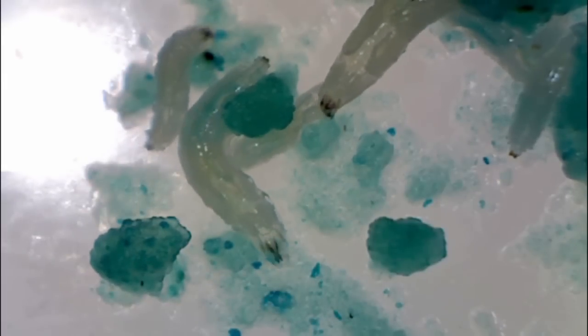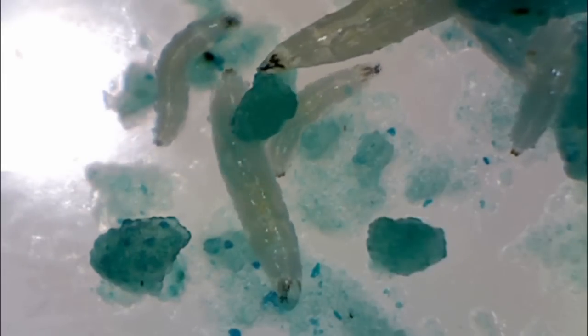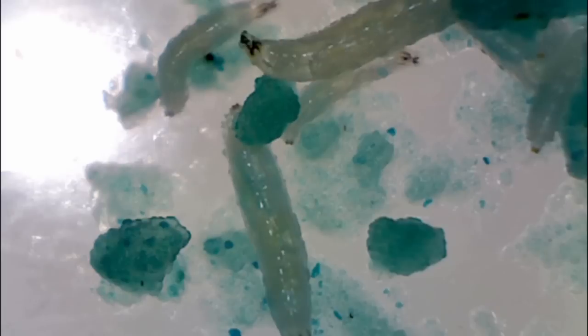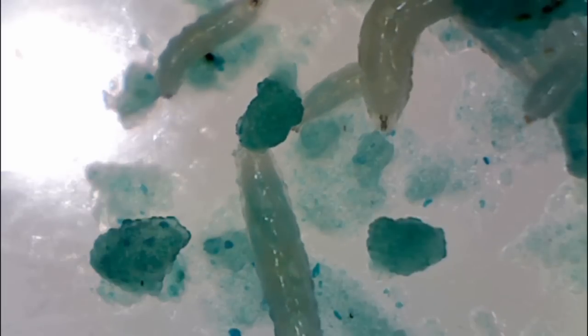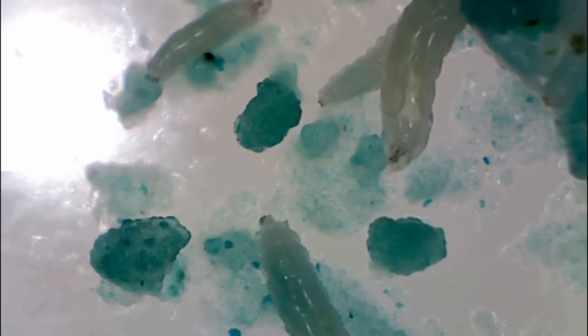The larva grows rapidly. As you can see, they are voracious foragers. The media they are eating is colored blue, making it easier to see the larva.